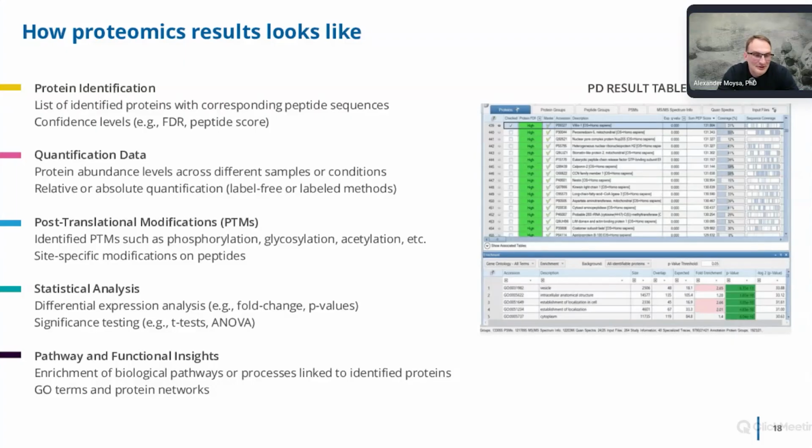After processing of mass spectrometry data, we obtain a list of identified proteins, each with an associated score. In the peptide information for each protein, we can also find any identified post-translational modification. If a quantitative experiment was performed, the result will include values related to protein abundance. However, representing proteomics data solely as a table is not always convenient, especially when we have several sample groups that contain multiple samples. Some of the common methods for visualization of this data I will show in the next slide.